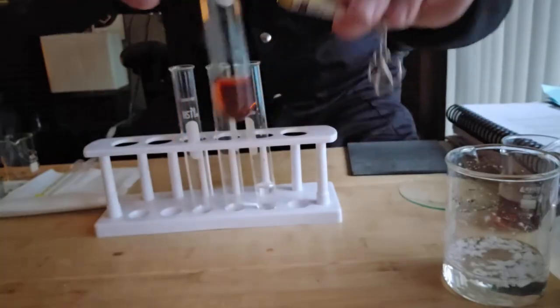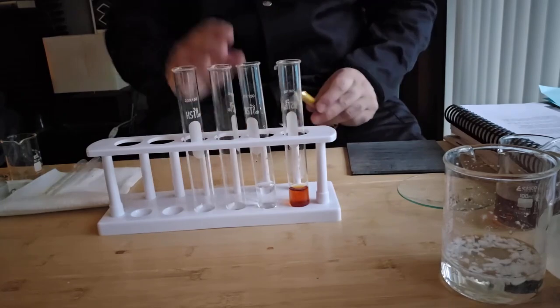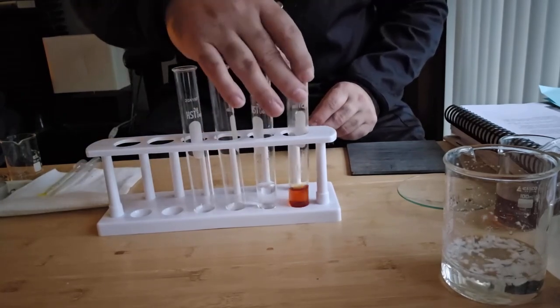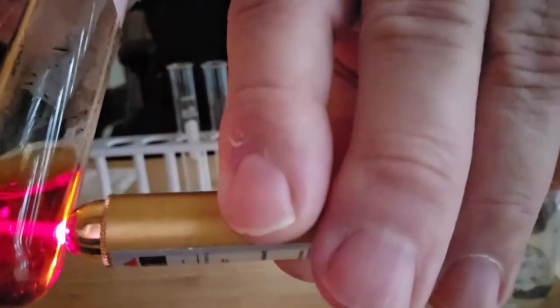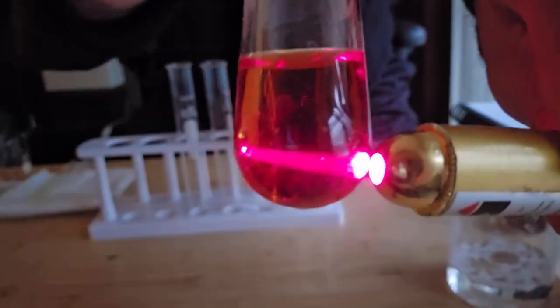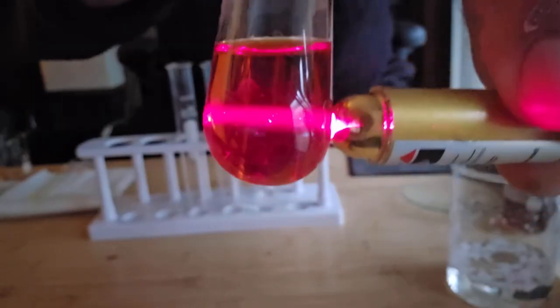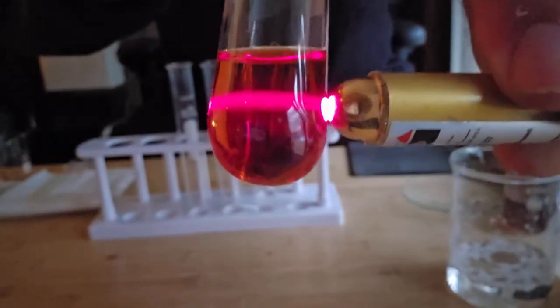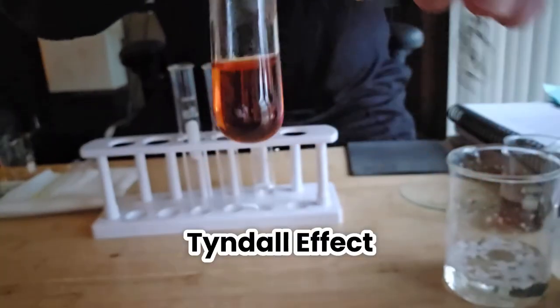And this is a strong indicator, and the phenomenon, a difference between the two solutions, is because the sol has very tiny, I don't know if you can pick it up on the camera, very tiny dispersed particles floating around the solution, dispersed throughout. And that's why the laser beam can be picked up and reflected. And this is called the Tyndall effect.